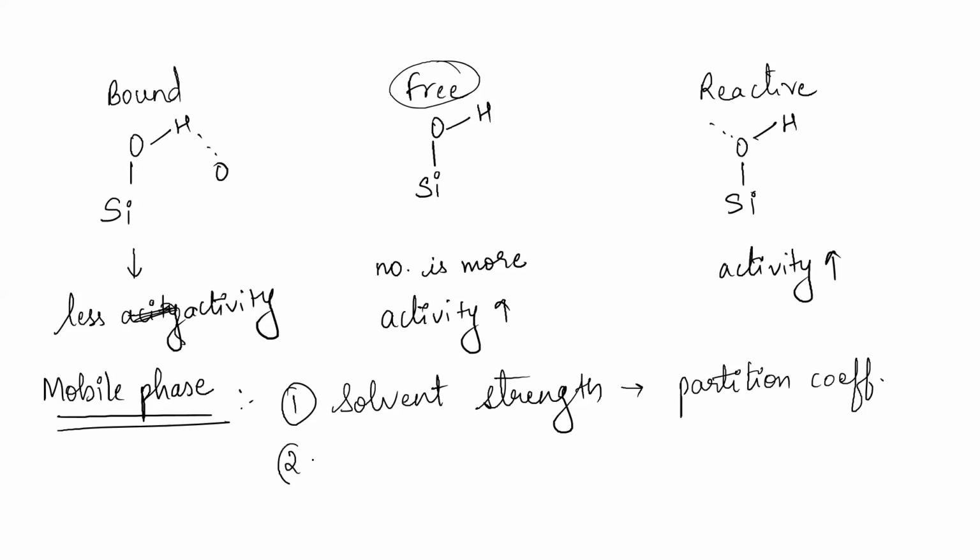And secondly, the polarity of the solute mixture. Okay, the solute mix that is to be separated.